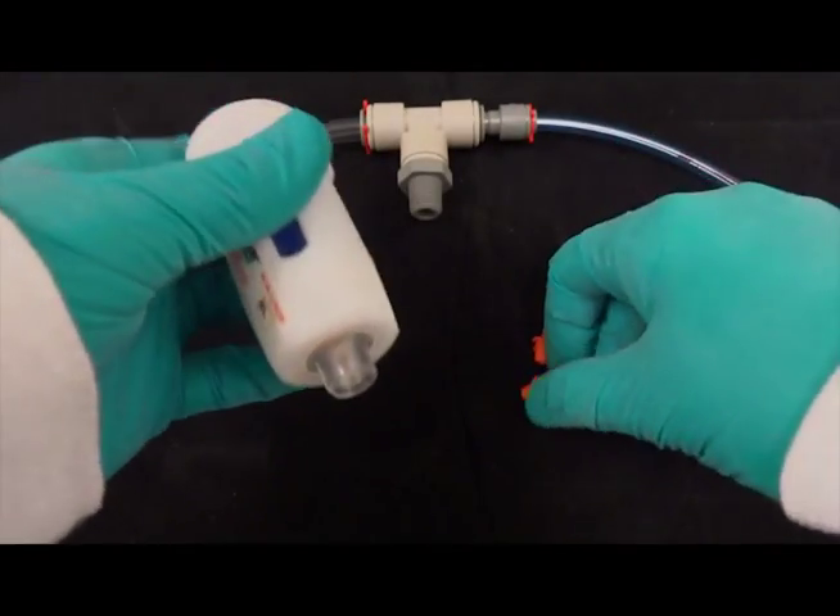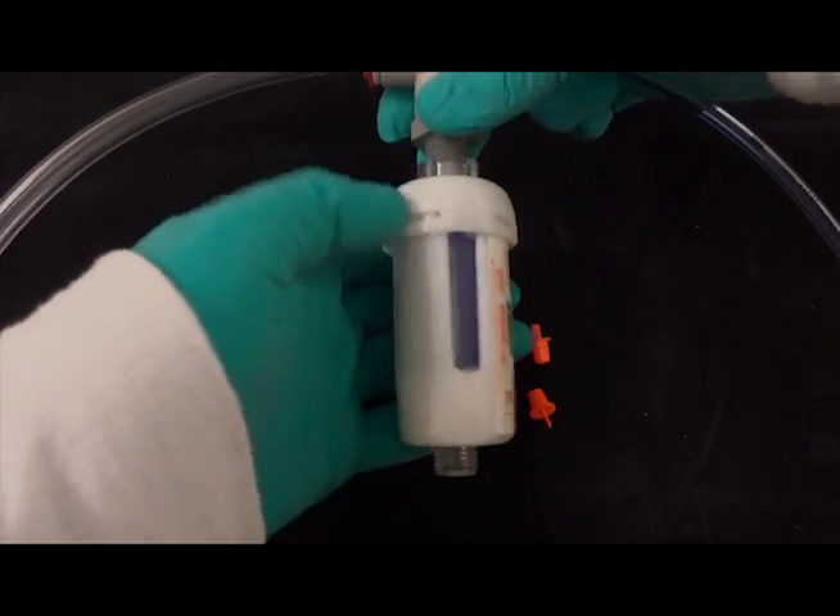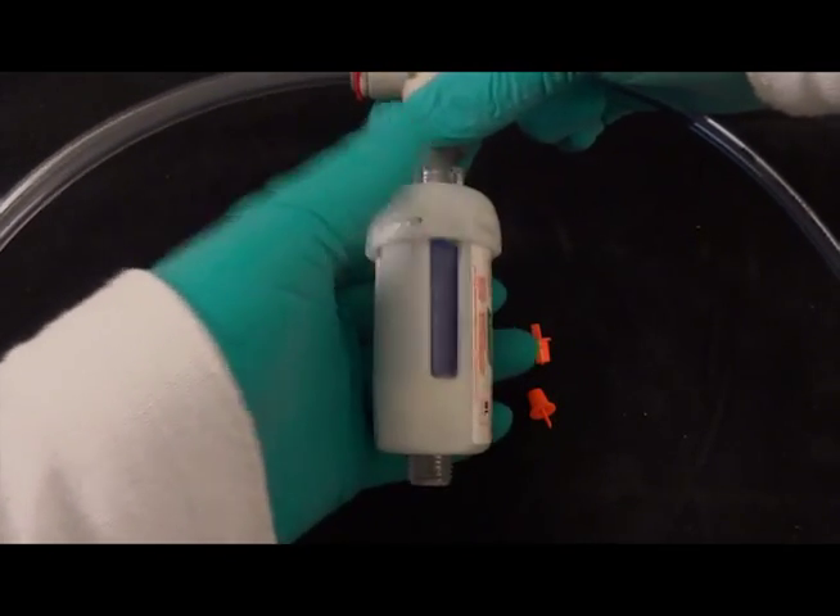The top of the drying filter connects to the supplied T-tubing adapter. Screw the drying filter onto the empty port of this adapter.